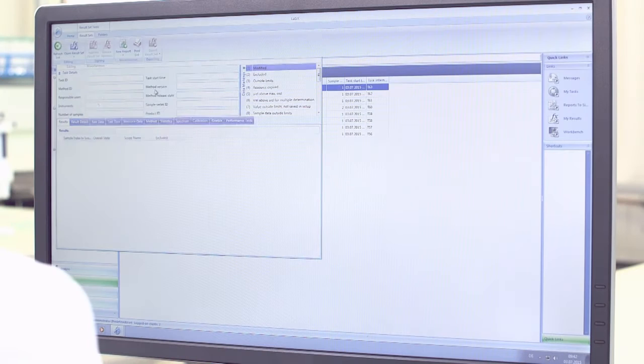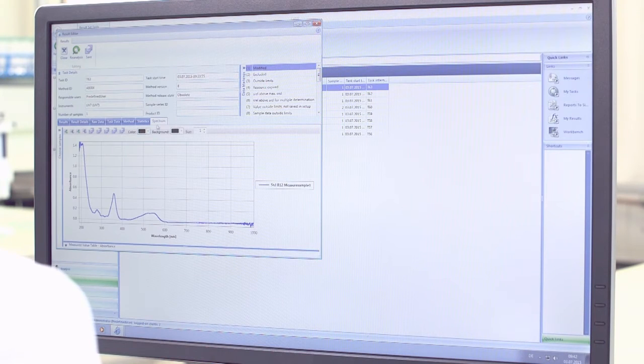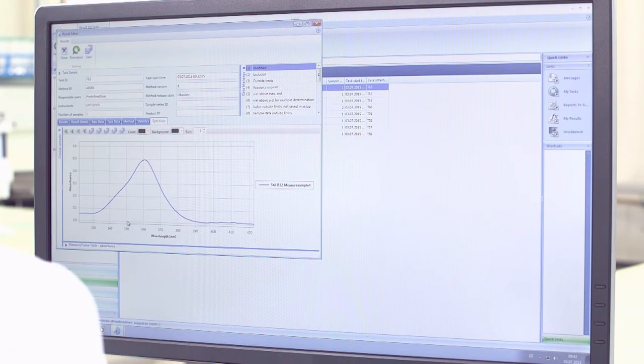The LabX results database provides immediate access to all data at any time. Automatic plausibility checks, report generation, and statistical evaluations of your results provide unparalleled overview of all of your processes.